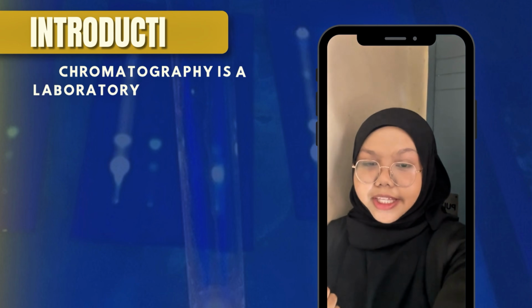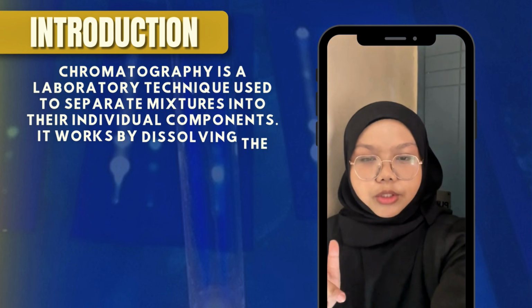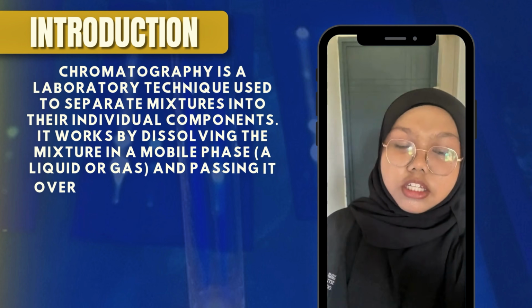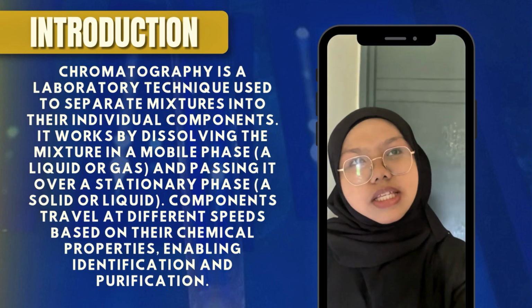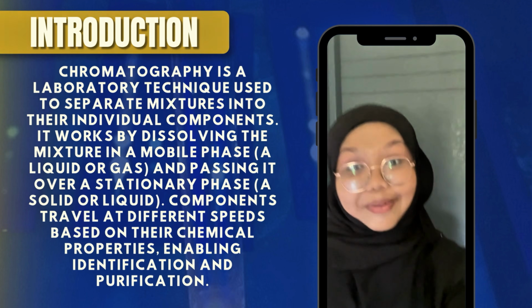Chromatography is a laboratory technique used to separate a mixture into its individual components. It works by dissolving the mixture in a mobile phase passing through the stationary phase.